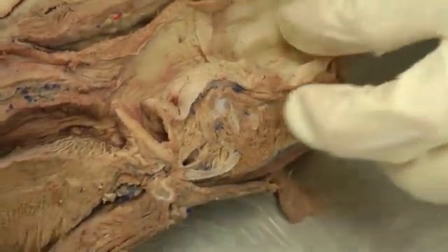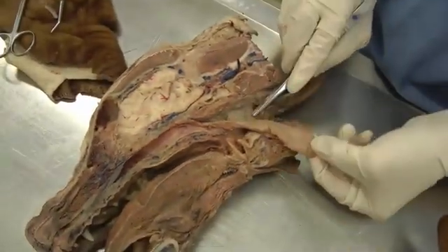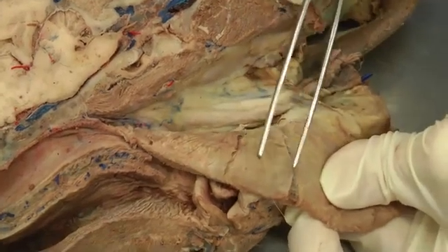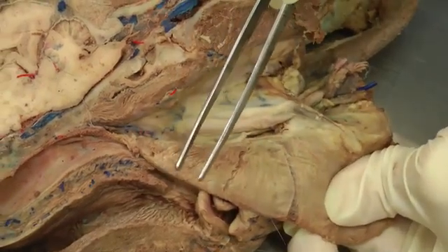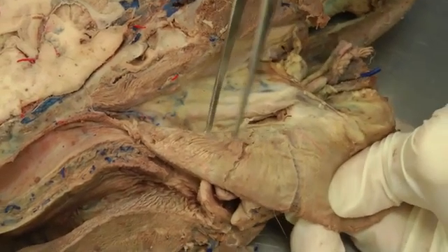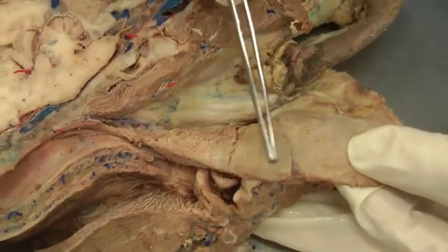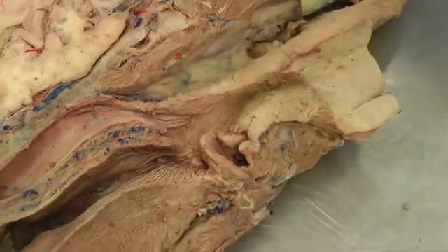One last thing, a little tricky: going dorsal to the esophagus and peeling away the connective tissue, you have some pharyngeal muscles that are difficult to identify. This one would be the cricopharyngeus muscle. Moving forward towards the nose is the thyropharyngeus muscle. And then here is the hyopharyngeus muscle. These are difficult to distinguish from each other, but they all sit right dorsal to the pharynx. That should be it for lab 22.